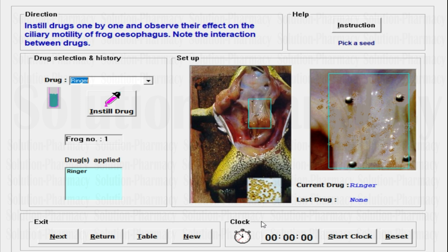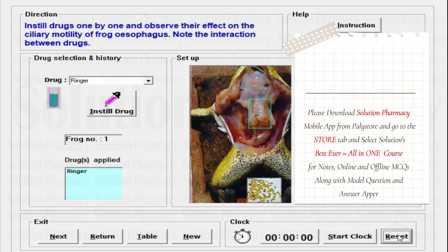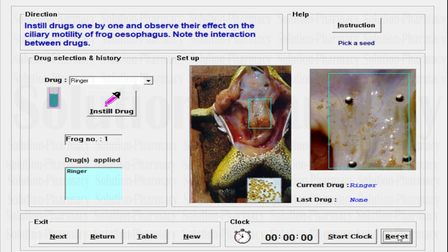Next to the Exit tab, you will observe the Clock button, which is very important and crucial for this practical. The Clock button is essentially a stopwatch. At the initial stage, it shows 00000, meaning no counting has been started. Just beside the clock stopwatch, you have an option to start the clock. Once you click Start, the stopwatch will begin counting. When your observation is over, click the Stop button to stop the count. If you need to do it again with another drug, click the Reset button to return it to zero.